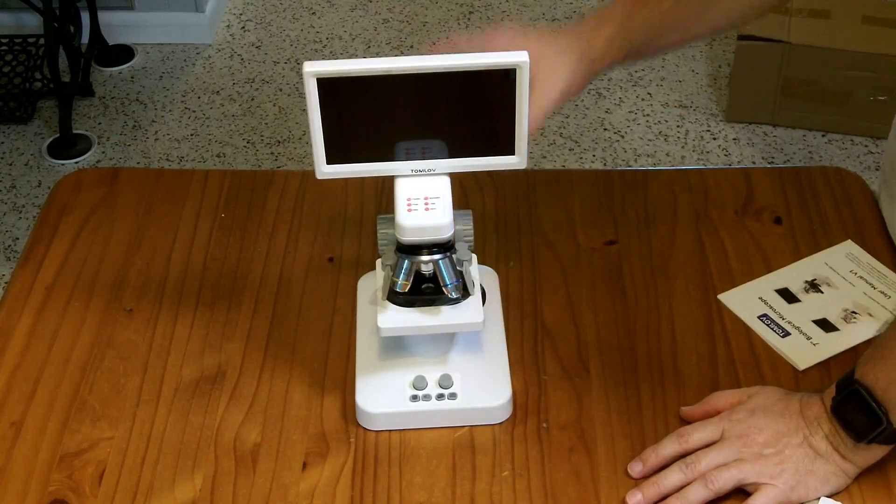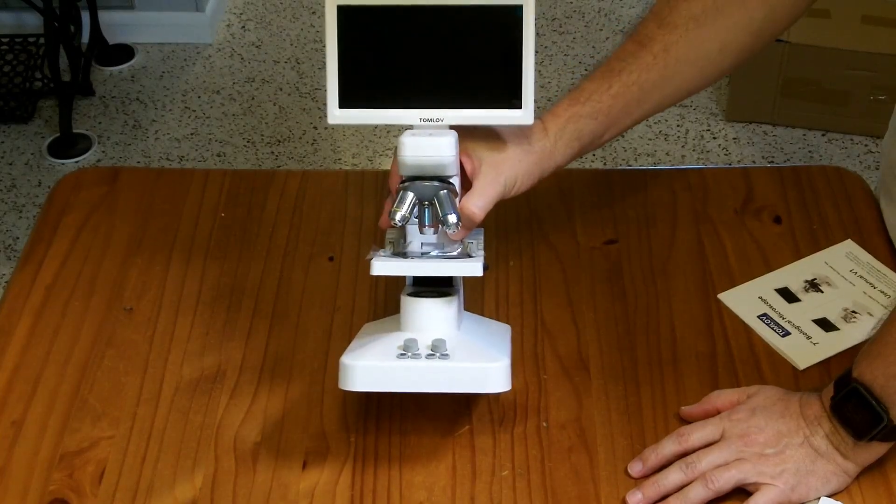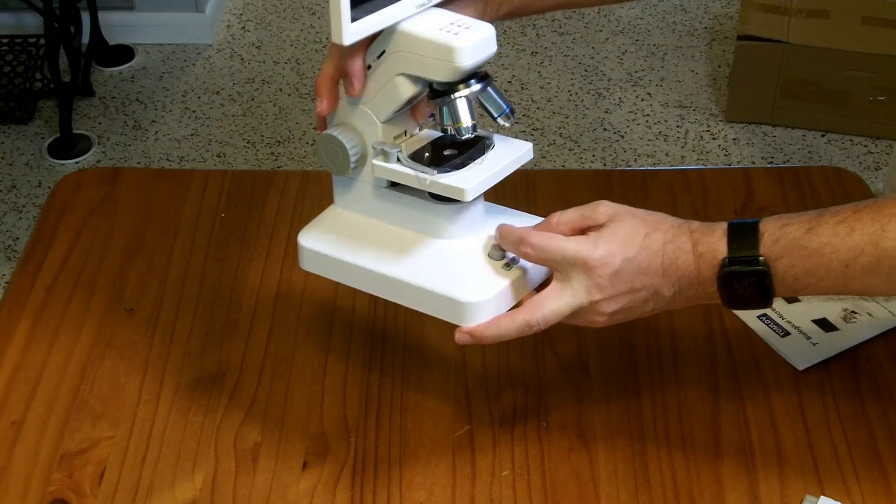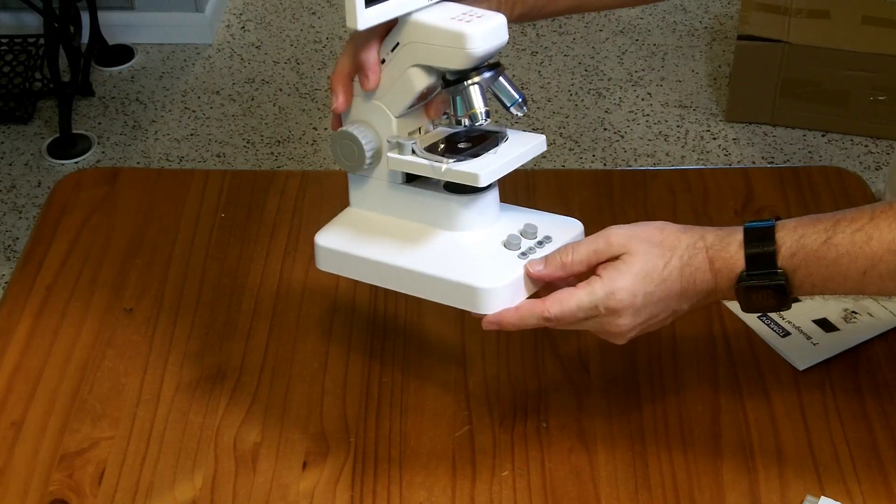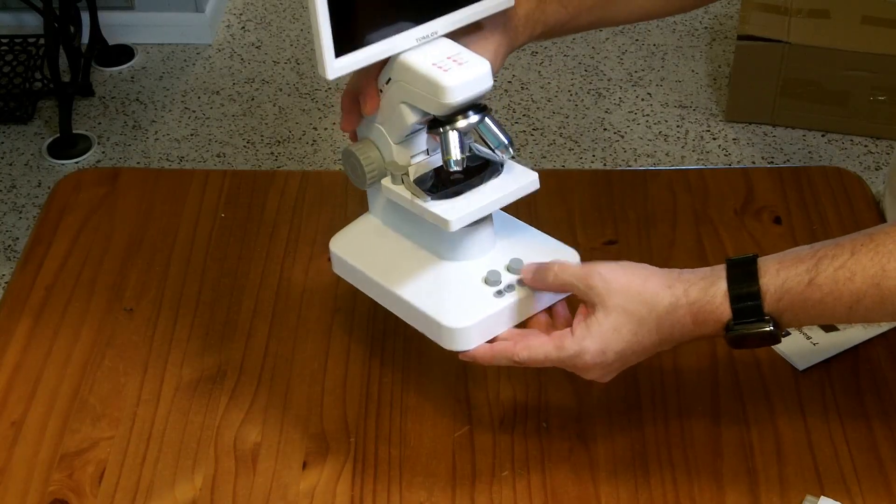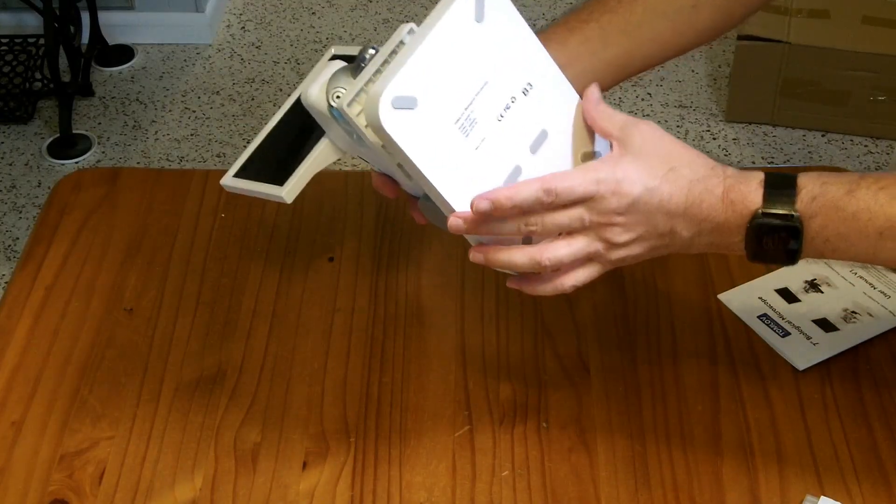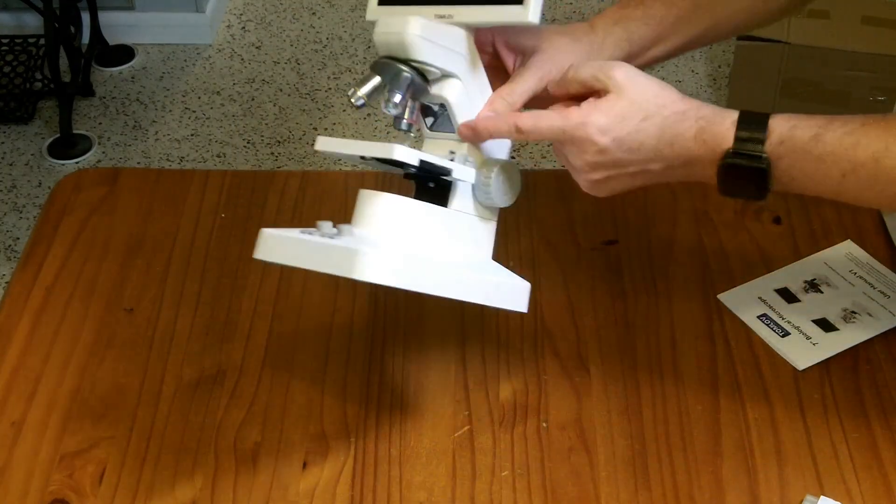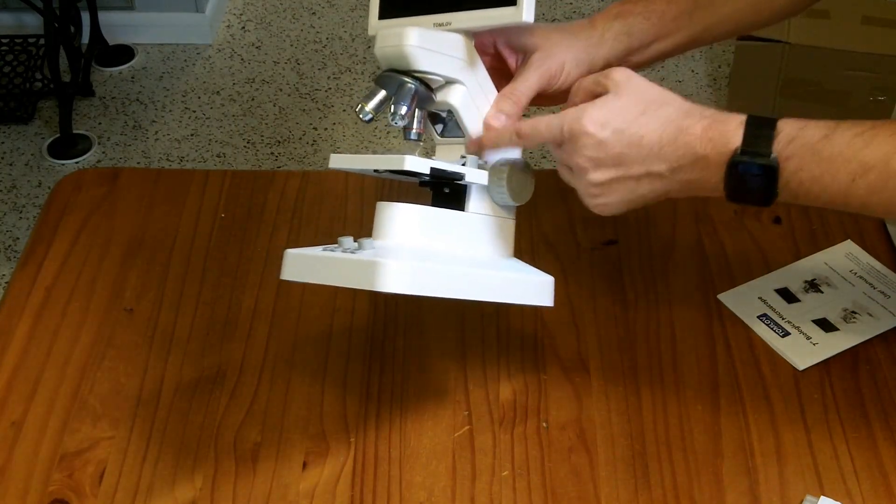According to the specifications this can do up to a 1200X magnification. We have some controls down here, looks like light level, something else, camera, take a picture, take a video, probably playback, and I don't know what that is. So we'll have to explore the user interface. But there is a bottom light, and there is a light up here for illuminating from the top.